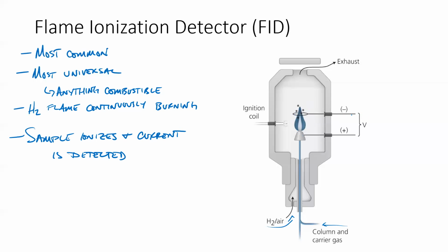Here it's showing this negative voltage is attached to a ring. It's almost like that mesh that we saw in the mass spec detector covering, right? So that mesh, and then as the ions pass through it, moving charge generates a small current, and so you make a small current in these little loops of wire, and that's amplified by the electronics.